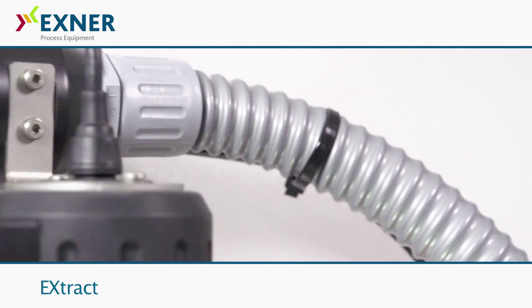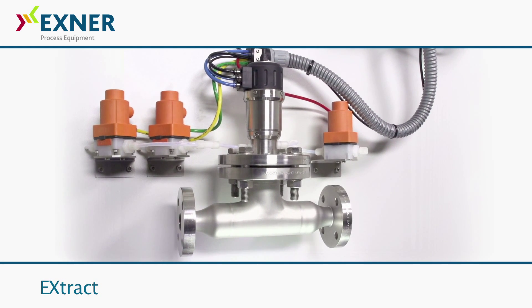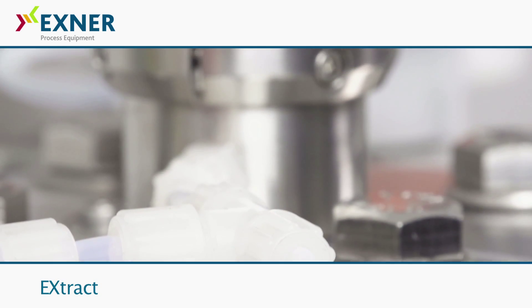The pneumatic connections are size and color coded, making installation extremely easy. We call it plug and play.